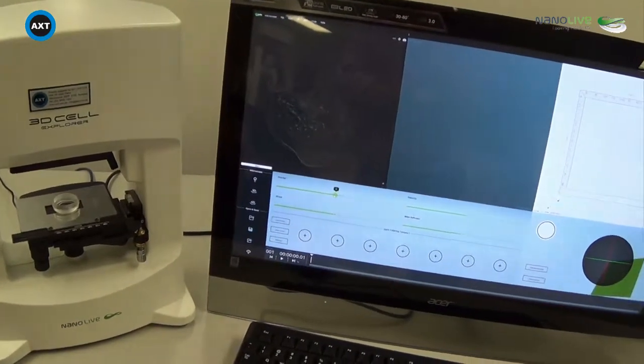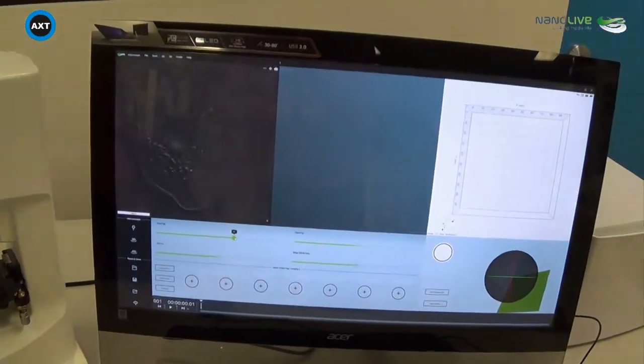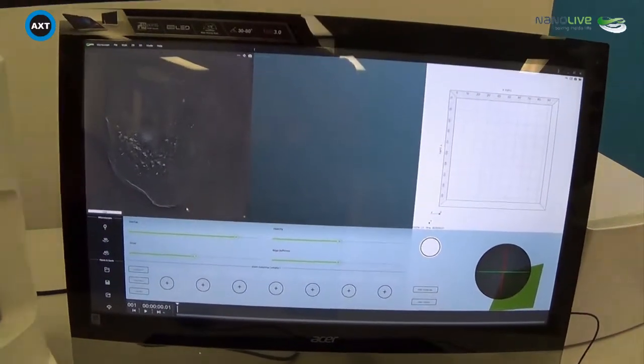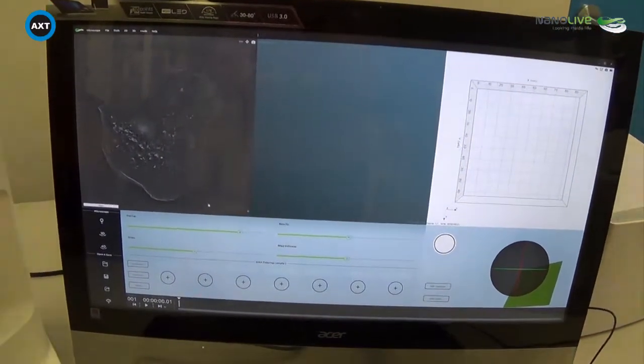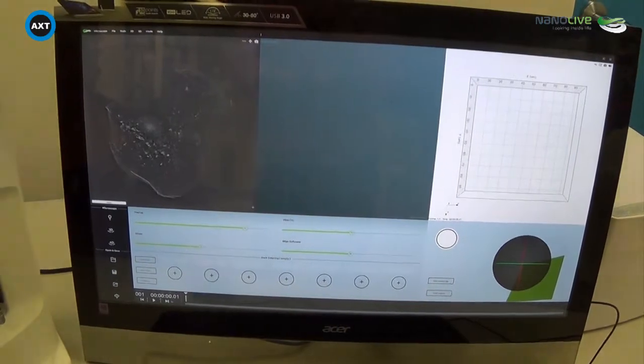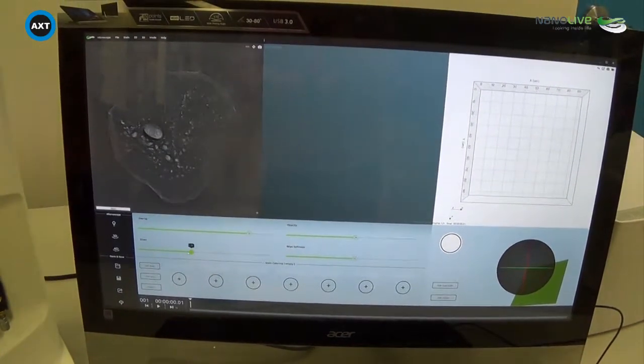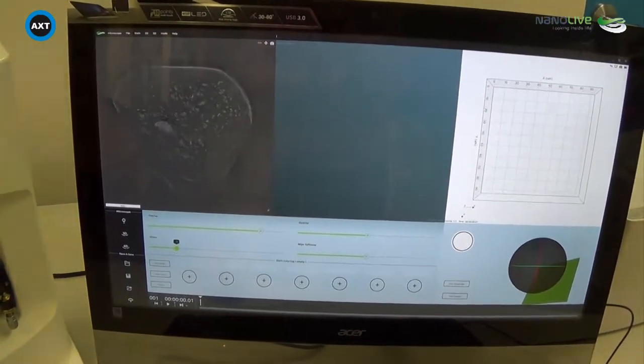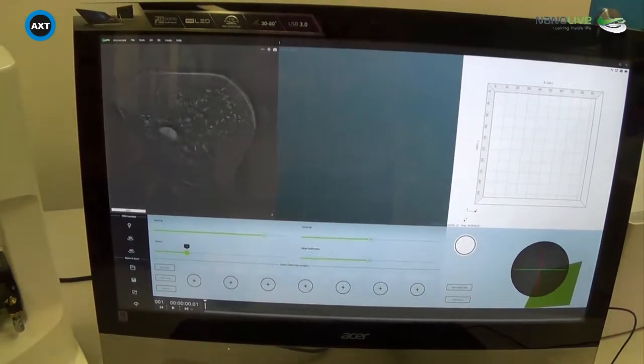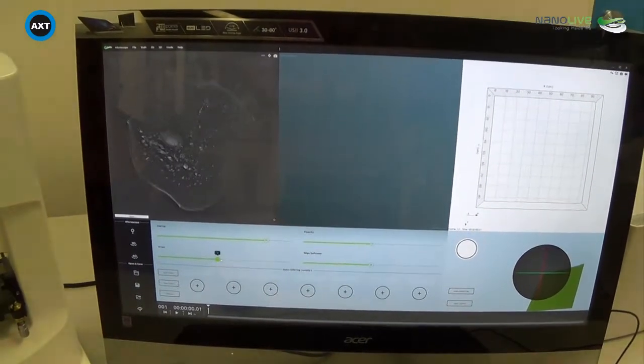And here we have our 3D image. If I just turn up the light, we're able to see a 2D slice of that cell. And we have a slider here that enables us to go through those slices. So we can see that the cell is quite curled up, curled at the edges, and it really does have a 3D structure.